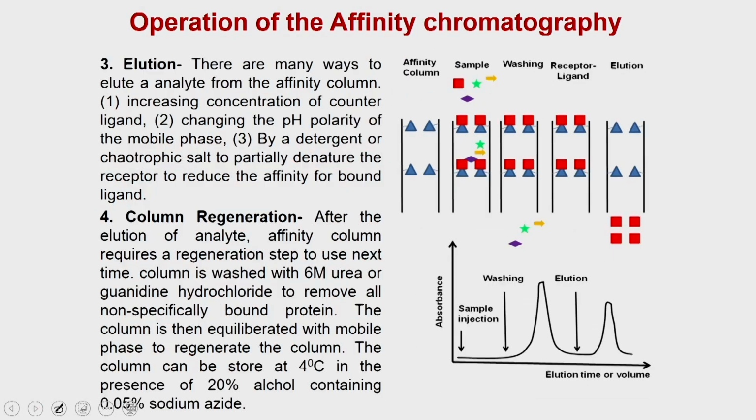After applying the sample, you are going to have a washing step, which means you can wash these columns with a buffer which contains high salt, so that it does not break the interaction between the receptor and ligand, but it is good enough to wash away all the proteins which are non-specifically adhered to the matrix.